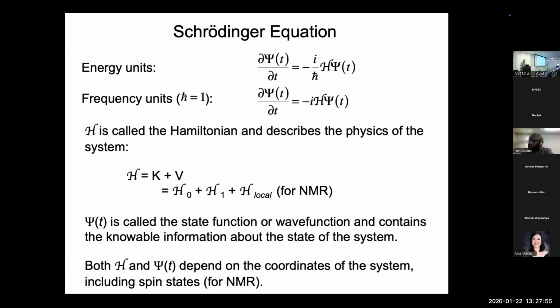basically negligible. For example, in quantum mechanics, you aren't allowed to measure Ix and Iy at the same time. There's an uncertainty relationship between them, but we do it all the time. That's how the spectrometer measures the signal, because the quantum effects are scaling down with the number of spins, and we just have an enormous number of spins. Nonetheless, the formalism that comes out of the quantum mechanics is the clearest way to explain the experiment. Off we'll go.